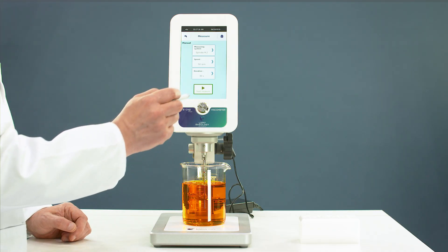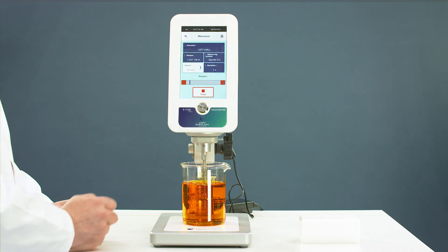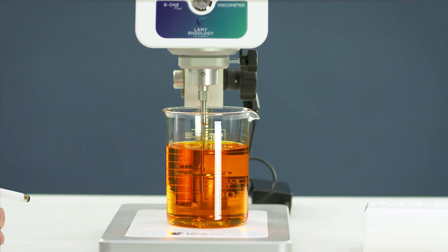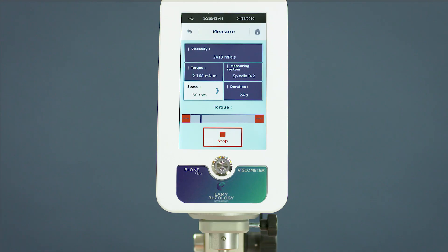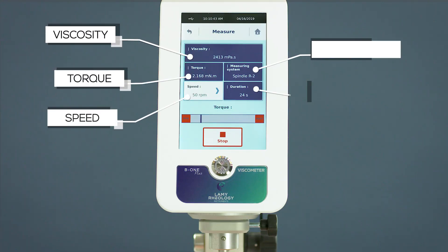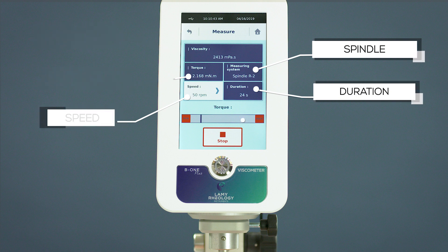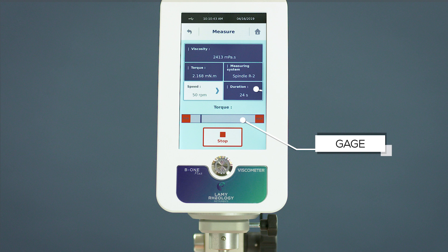Start your measurement. While measuring, the device shows you all information such as viscosity, torque, speed, spindle, and duration. A gauge allows you to see if the torque is not too close to the lowest or highest limit of the device.